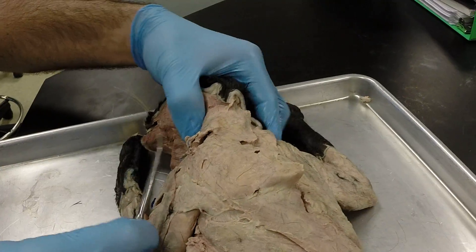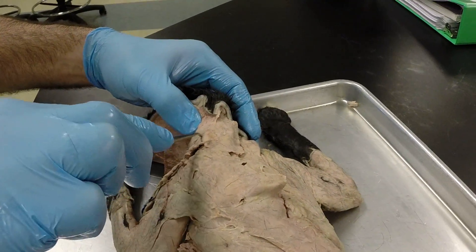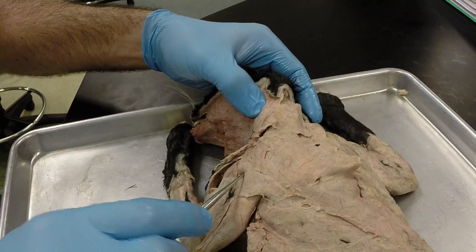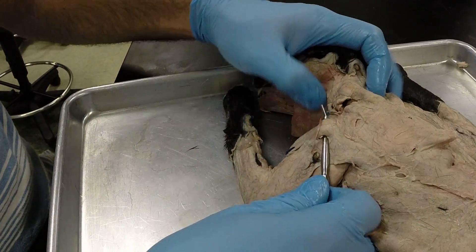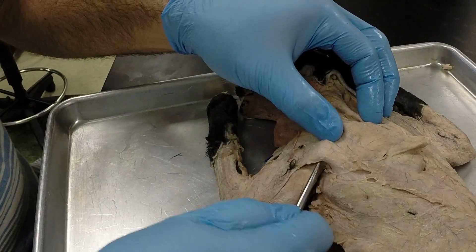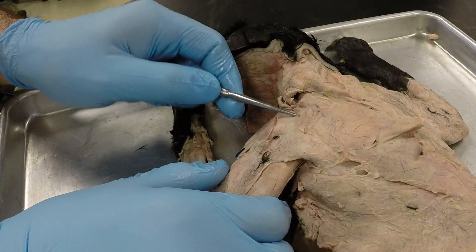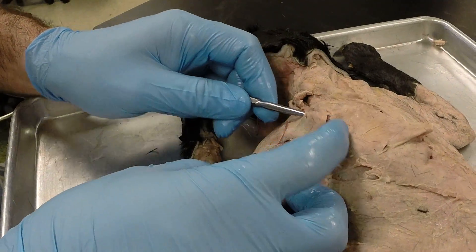Moving out to the arm, we have the clavodeltoid which runs down and along the anterior side of the arm. Then we have the acromiodeltoid. And then we have the spinodeltoid. And then kind of in between those we have the levator scapula.